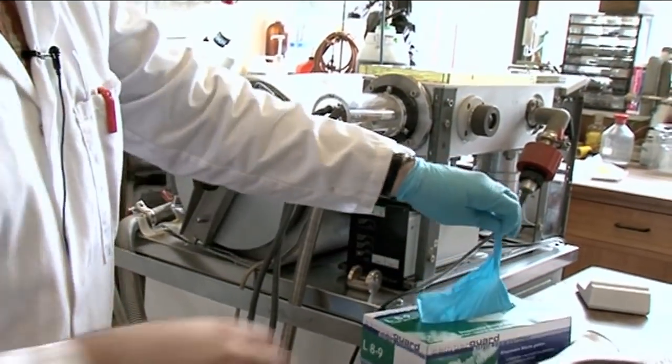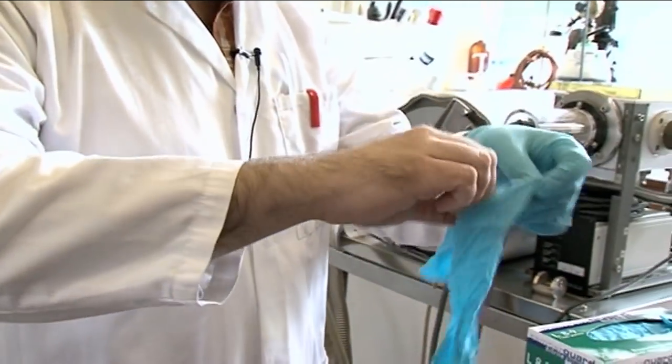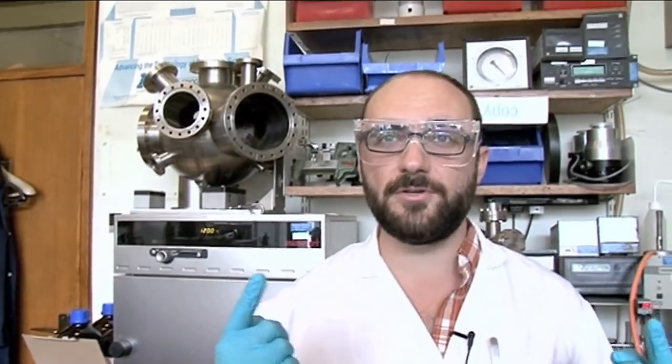Here we are in the lab with Neil, and we're playing with gold. I've got what they call glove hands — gloves just fit me like a glove. This is a really cool background. Gold, of course, is famously unreactive, which is why it's such a great way to store your wealth.